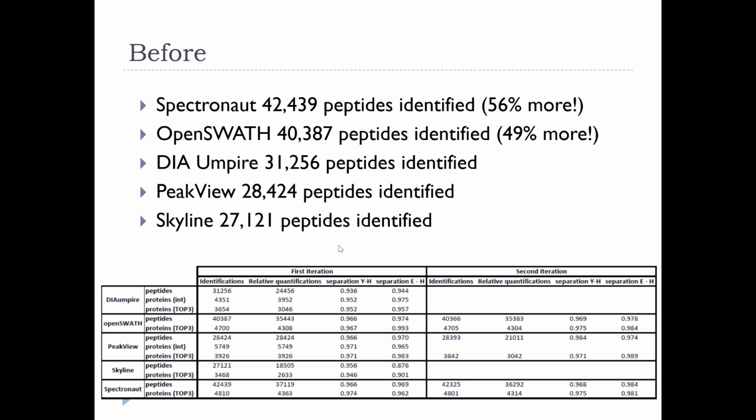I mean, what's the obvious explanation? The common explanation of a number of people on the telephone when we had the call about these statistics: the Skyline's just not as good. You know, these other things just do better.